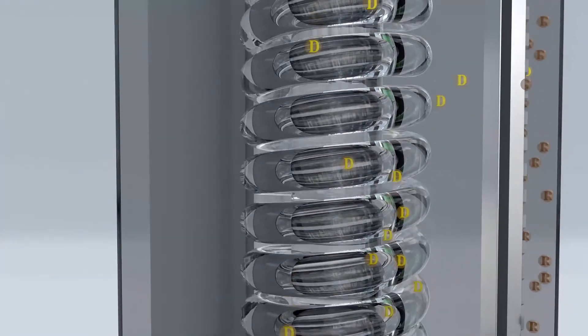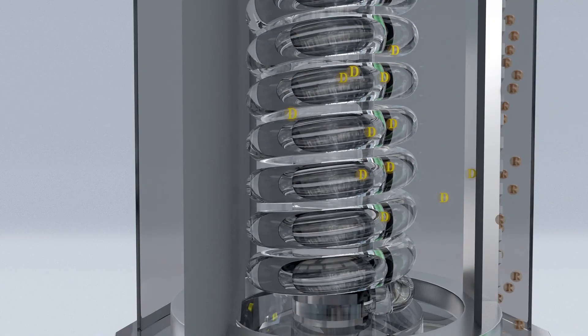The vapor phase molecules then returns to a liquid phase on the condenser, which is at a lower temperature. Finally, the distillate drips down the coils of the condenser and is pumped into the receiving vessel. The residue flows down the sidewall of the evaporator and is collected into another container.